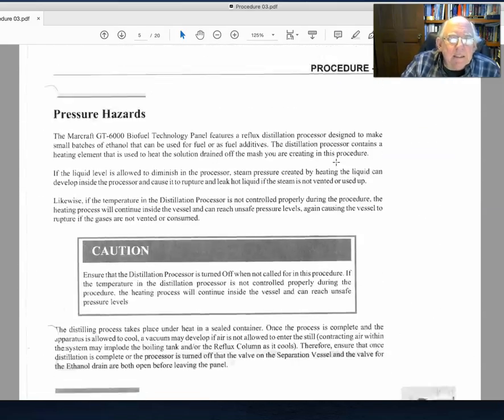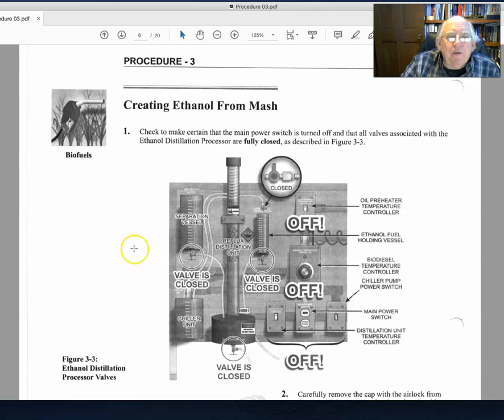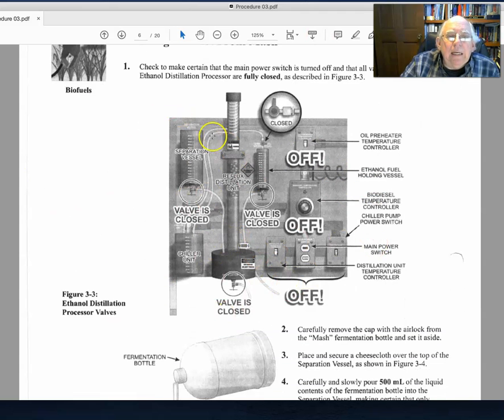In essence, what this lab consists of is going down and just very carefully putting in the material, the mash, allowing the mash then to go into the boiler. Allow the electronics to cause the boiler to come up in temperature, and the distillation column then allows the ethanol to finally condense and be collected in a holding vessel for later measurements.